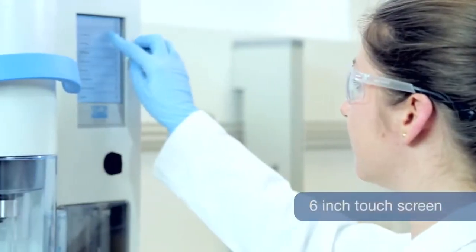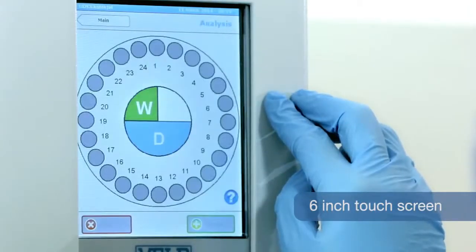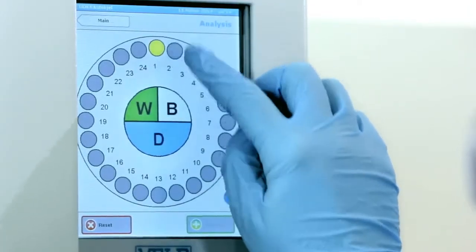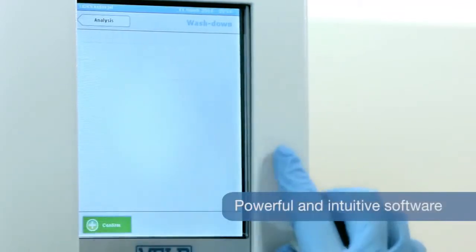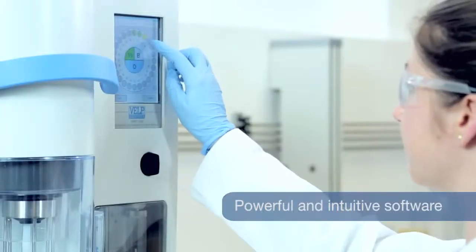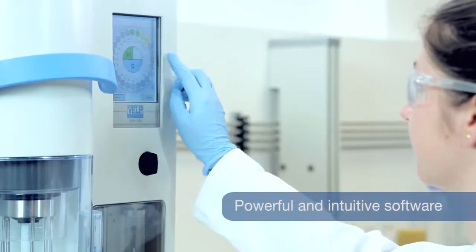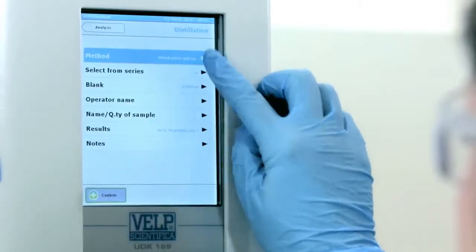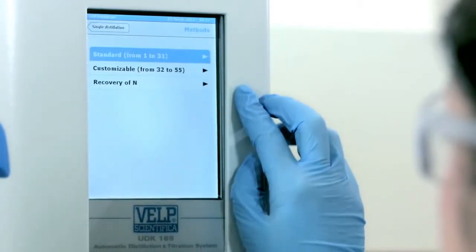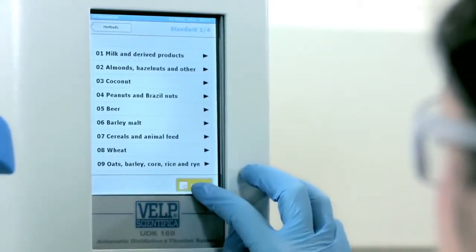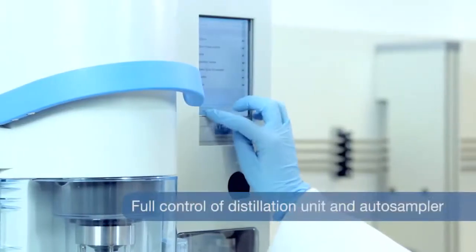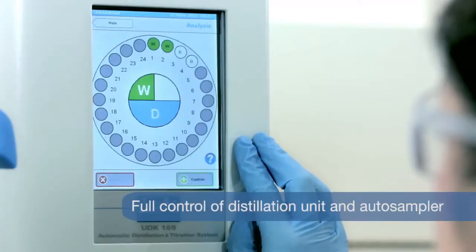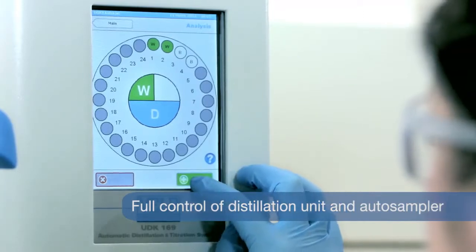Its 6-inch touchscreen gives information on all of the process. Washings and blanks can be programmed very easily. A 55-program library covers the needs of any laboratory with the right mix of customizable and pre-installed methods for the most common applications. The software offers full control of both distillation unit and AutoSampler.